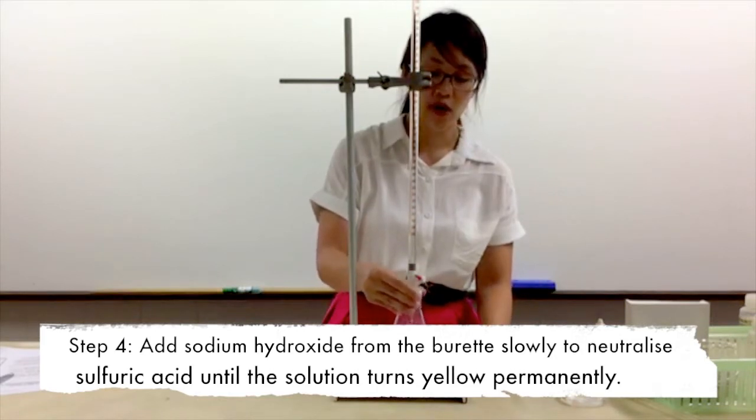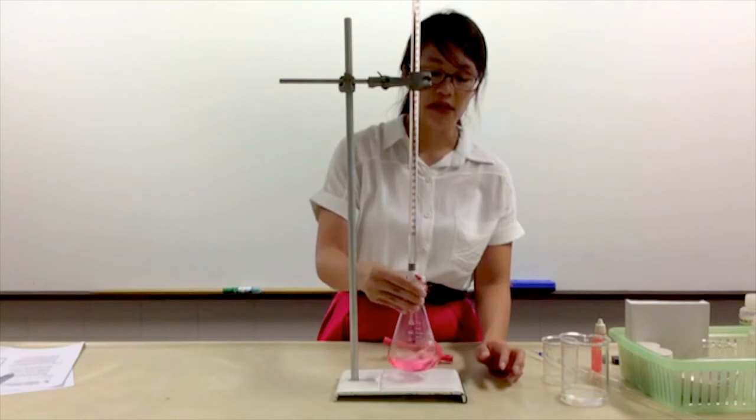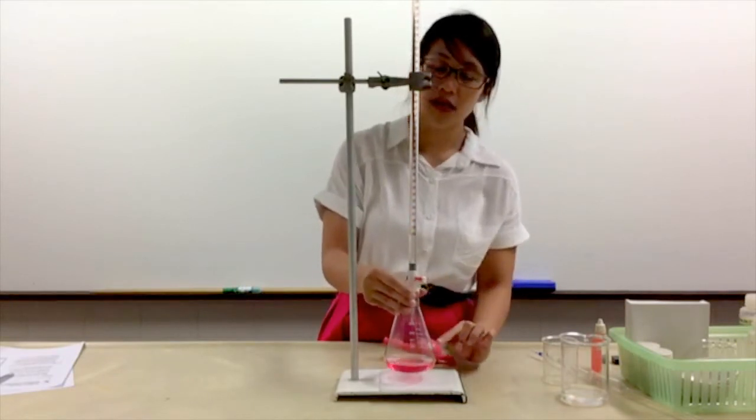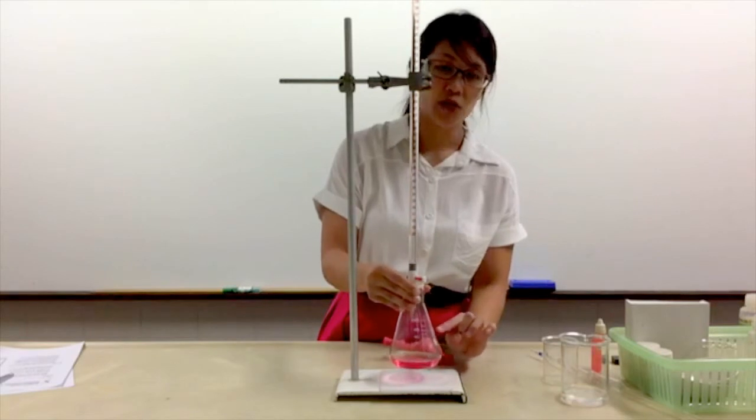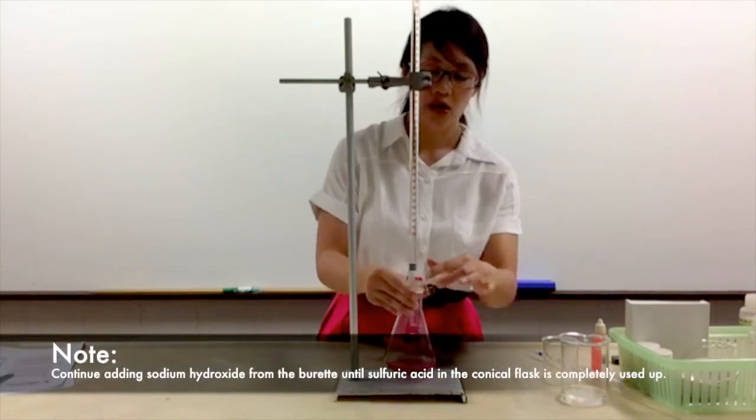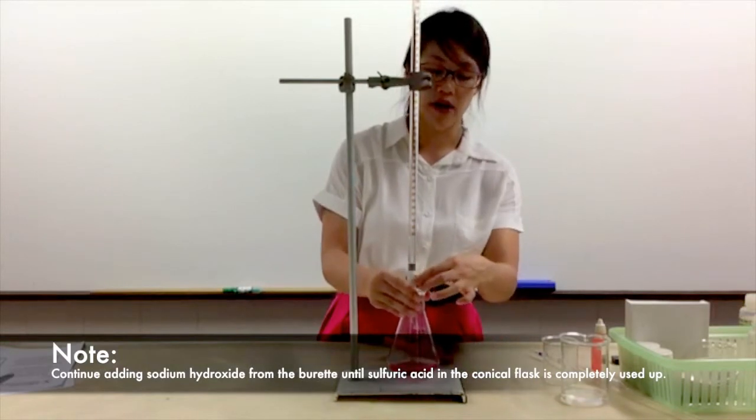As I swirl, I will allow thorough mixing of the acid and alkaline. Can you see that it is still red? Which means that there is still acid in your conical flask, so you need to add more alkaline from the burette.